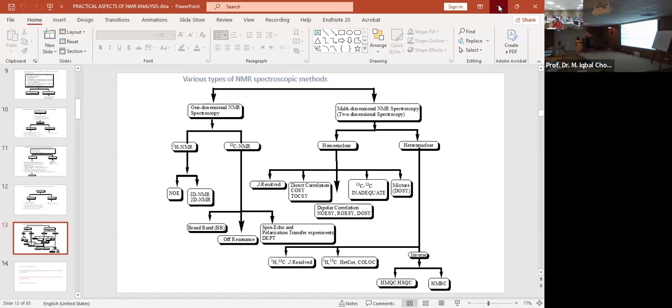Thus your solvent below this part and your solvent above this part, even if you fill up the tube, has no effect. So 0.5 ml is just right, a little bit up, because whenever the solvent is there, there is a small curve, and we do not want this to interfere. So we cannot have less than 0.5 ml. Otherwise it will come to face the radio frequency, so our peaks will be disturbed. Okay, I think it's clear.